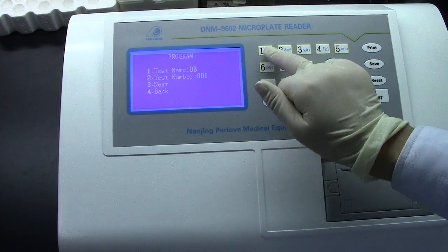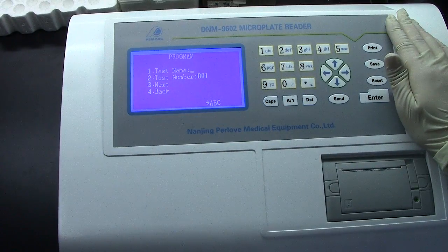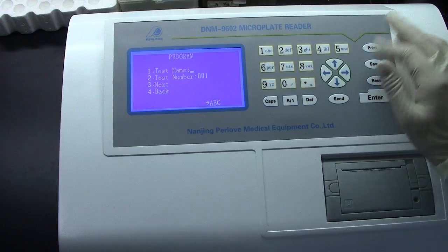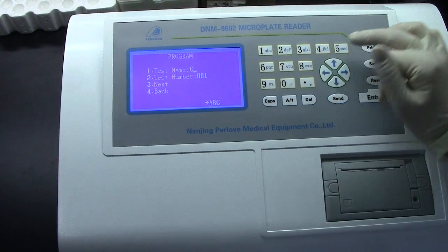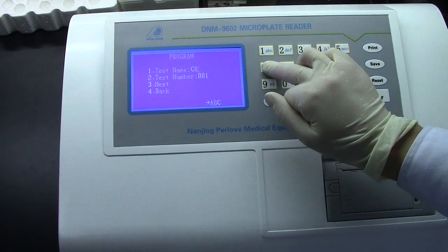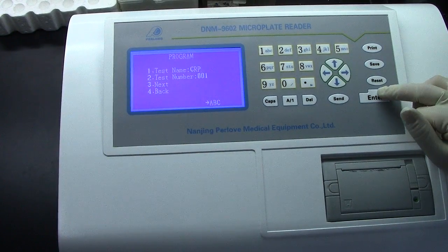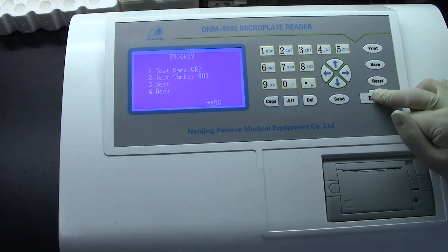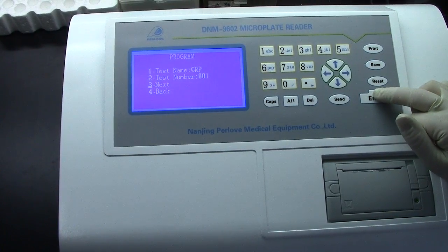We want to change the test name. Press 1 to change it. We want to input CRP. Press End to confirm the name. The test number 001 is OK.